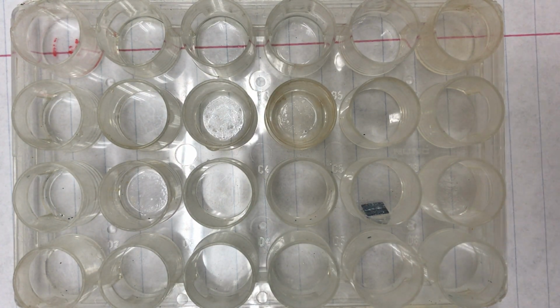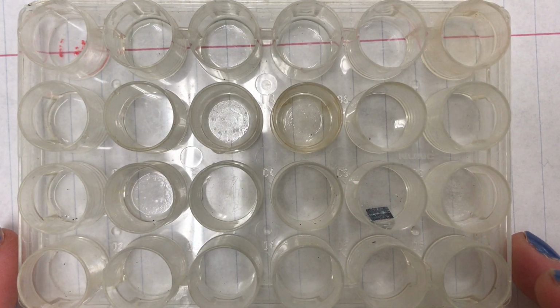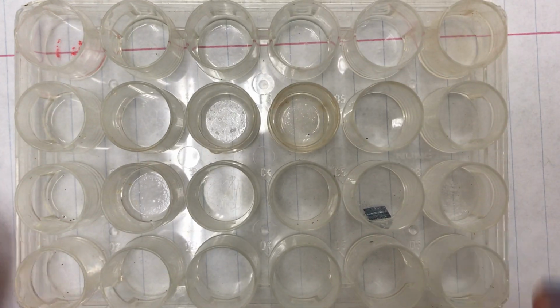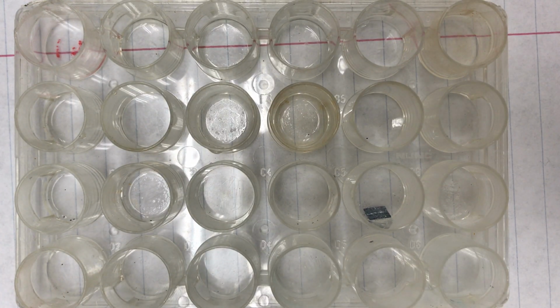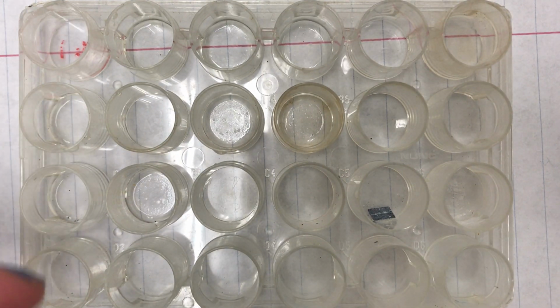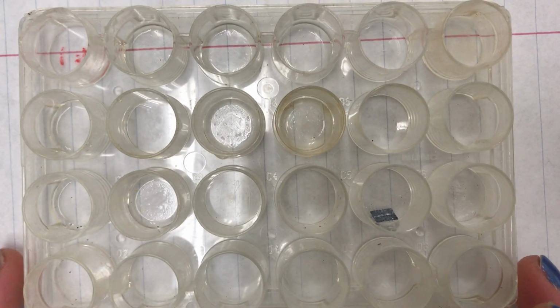Hey guys, this is the video for the Qualitative Single Replacement Reaction Lab. Starting with step 2, it says obtain a 24 well reaction plate, which is what we have here on camera. And then it asks us to use the labeled bottles of solution to add drops in here. Alright, so we have A, B, C, and D, and 1, 2, 3, 4, 5, and 6.